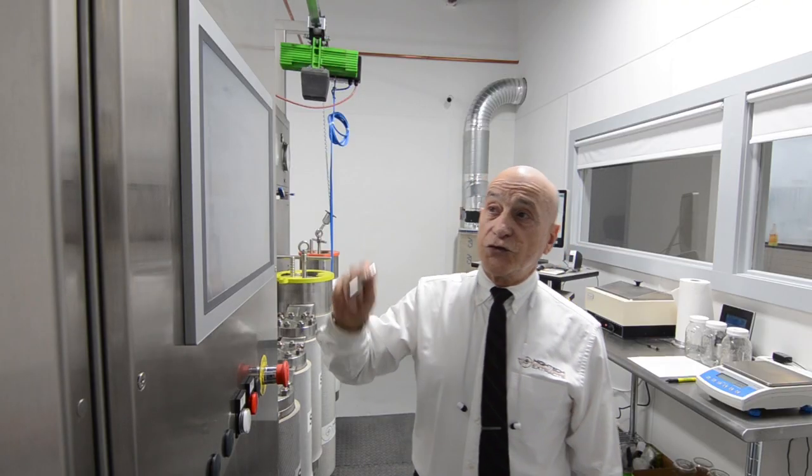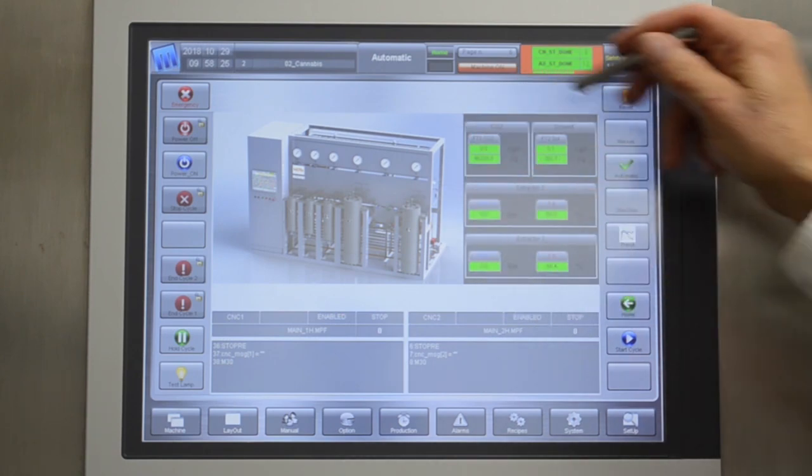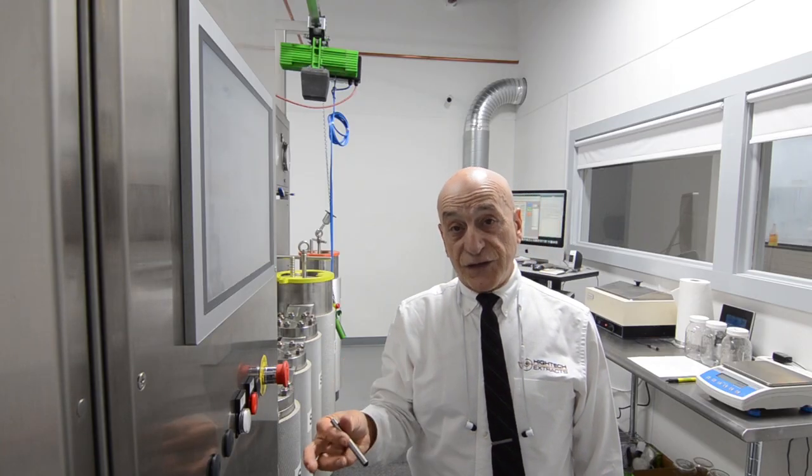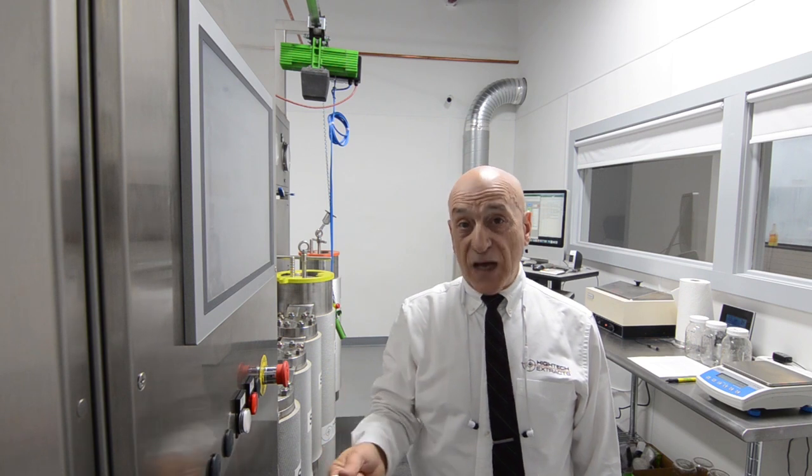All of these things that you can do on this screen, the layout, the manual, you can also do on your desktop, laptop, tablet or phone.